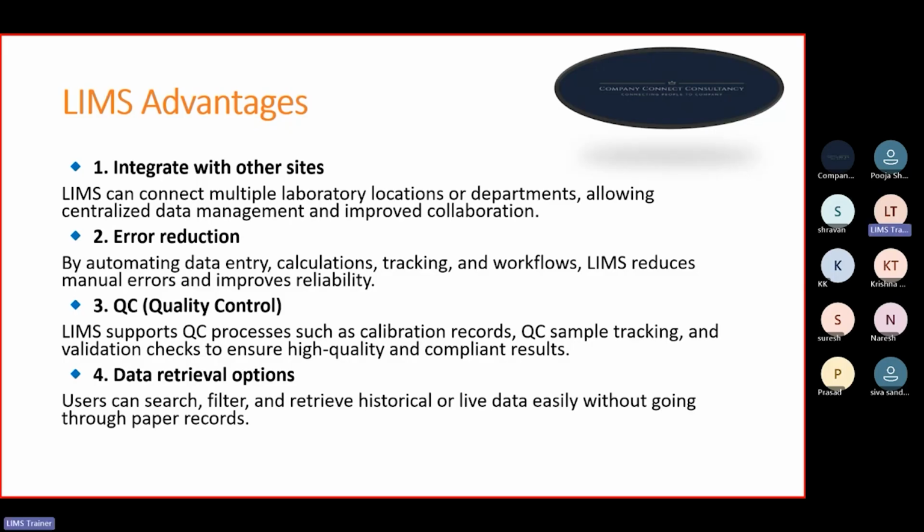Okay, after that the tracking. As there are unique IDs for each sample, that sample can be tracked anywhere, also with the workflows. The errors will also be reduced because we have the tolerances. We can add the tolerances into the master data, right? Let's suppose sample weight.